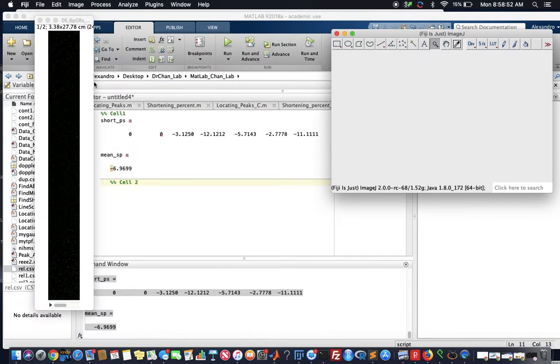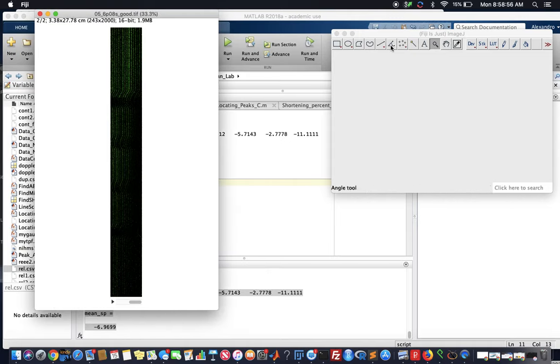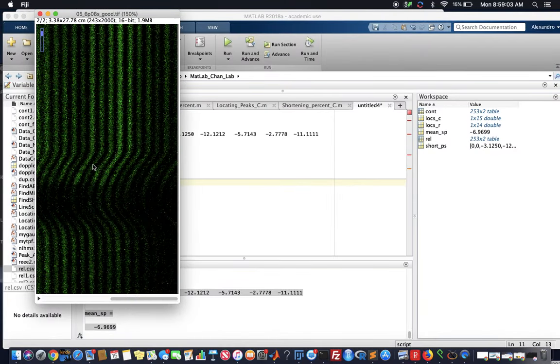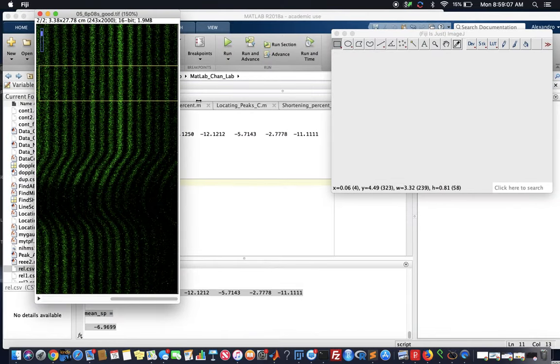Alright, and the reason I have 2 examples is because sometimes the bands go the other way. And so we want to make sure that we get the accurate results for those two. And so I made two different codes. They're basically the same, they're just small differences in between.